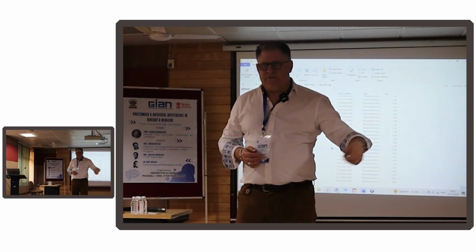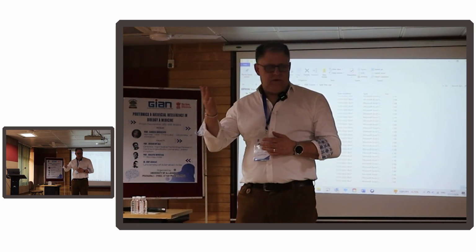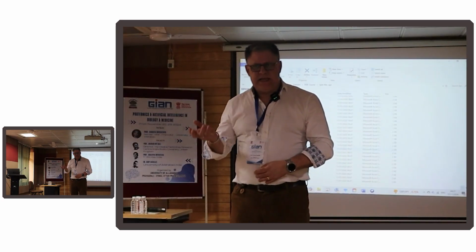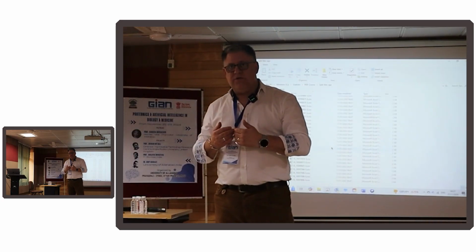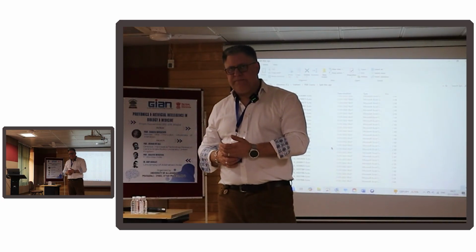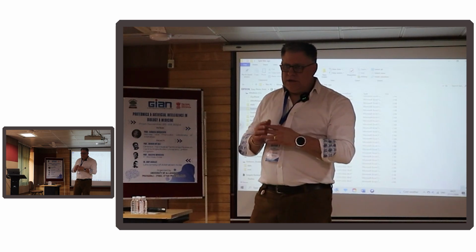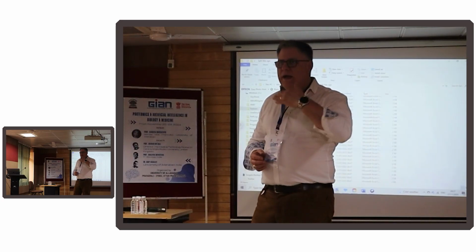So if I look at a different randomization of the data, I will find the same gene in the top 100, 200, 300 genes. If I repeat it again, by looking at the data and coming back to the same set of genes, if the same things keep coming out, I know they're important, and I know they're unlikely to be false discoveries. So this particular workflow is centered around that. Once the other part of Weka is finished, I'll show you how to use it to enrich.